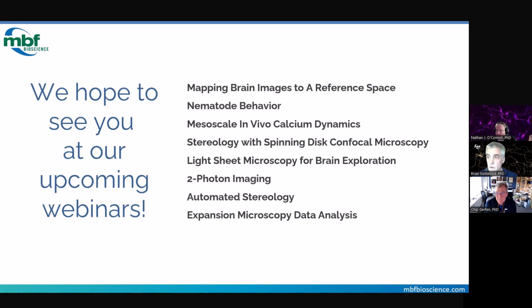considers the sectioning angle. We have a full model of what happens when you are sectioning a brain physically on a microtome, cryostat, whatever you use. That is something that is incorporated into the NeuroInfo software. And when we do that stage of registration, when we're targeting an atlas, we model exactly what that sectioning angle is. So that'll be covered very well in the next webinar that we do on the registration.